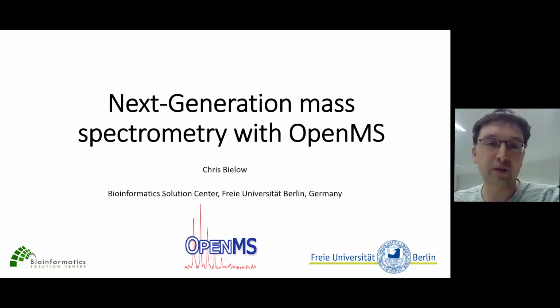Okay, perfect. So this talk is going to be about next generation mass spectrometry with OpenMS. My name is Chris. I work at the Bioinformatics Solution Center here at Free University in Berlin. So let's get rolling.